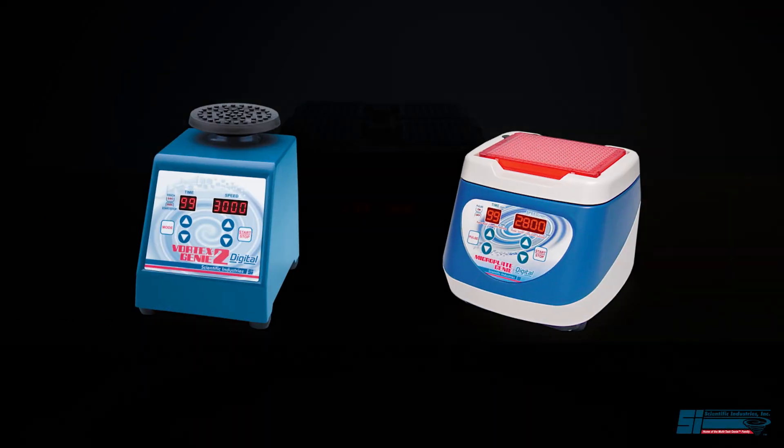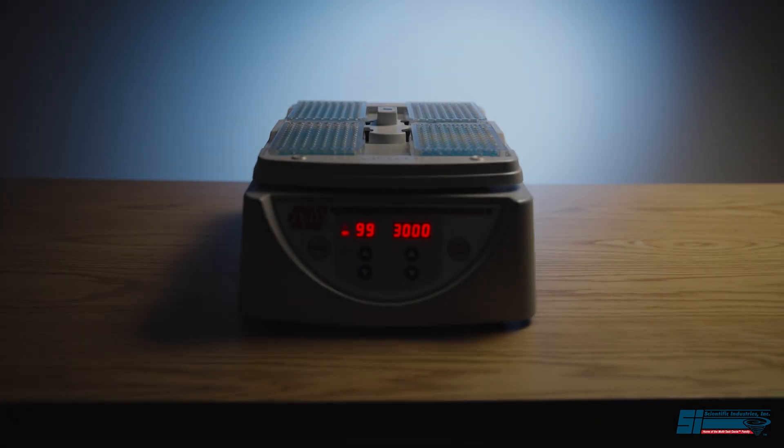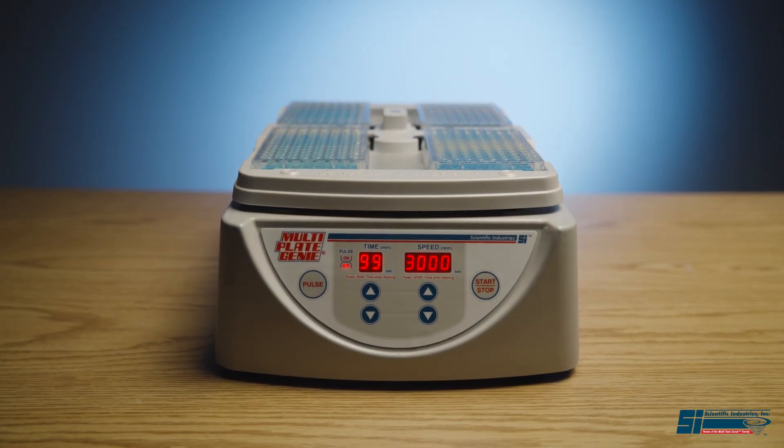From the makers of the Vortex Genie 2 and the MicroPlate Genie, the brand name you know and trust is proud to introduce the MultiPlate Genie.